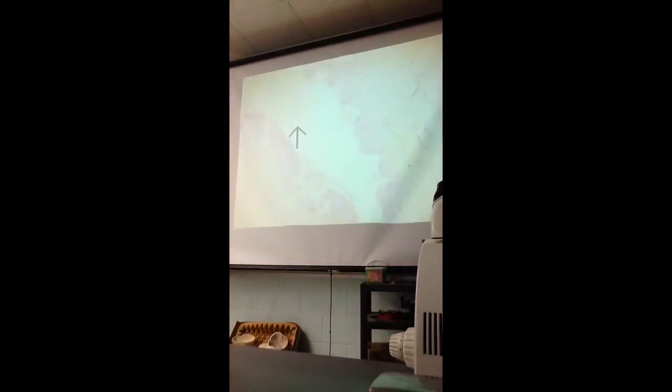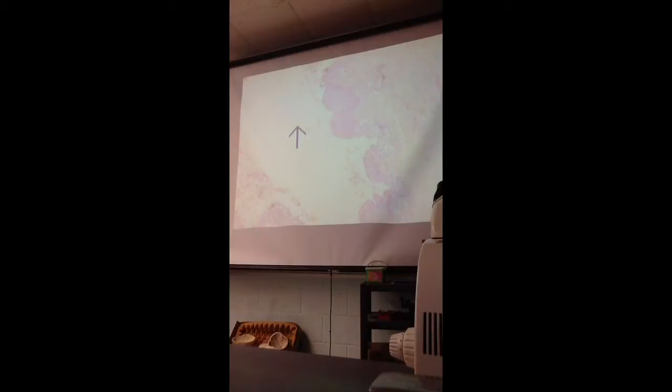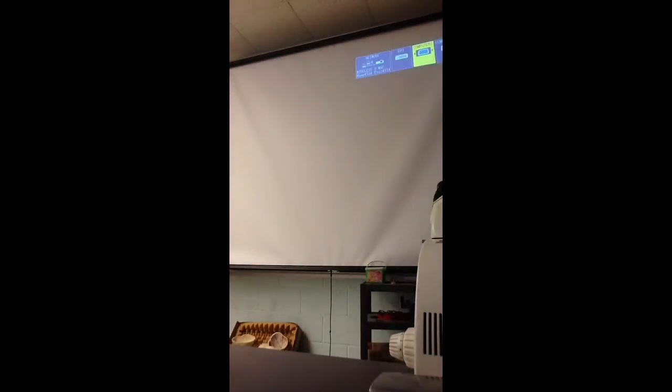So if this is the prostatic urethra, what's the type of epithelium? Transitional. Prostatic urethra is transitional. Okay. I'll show you the figure again.